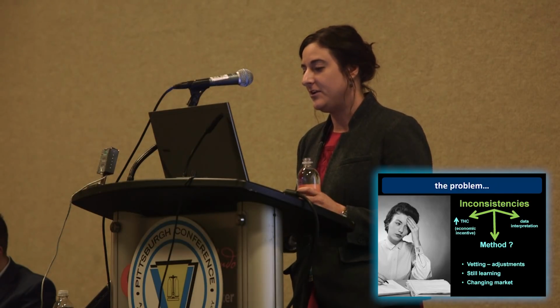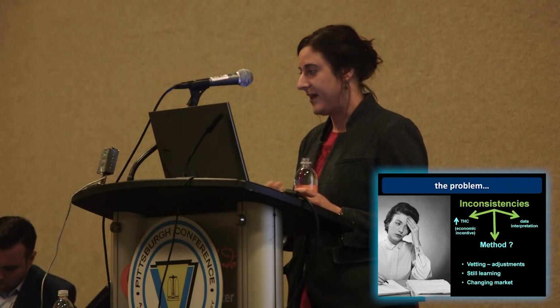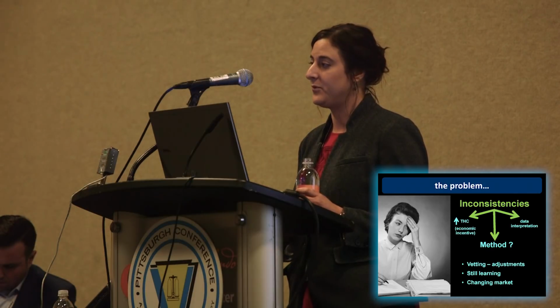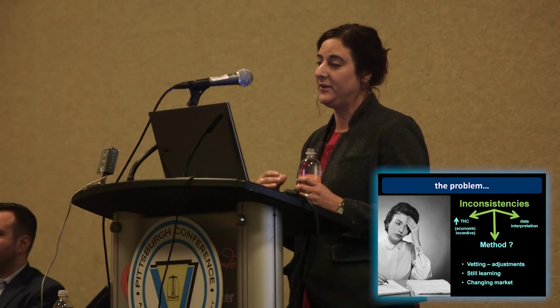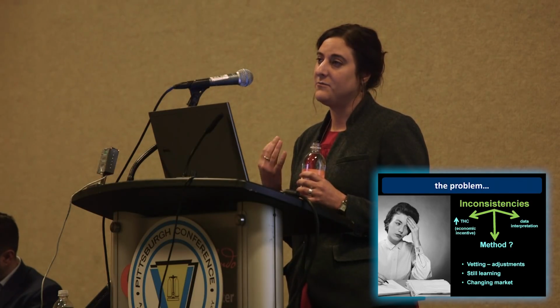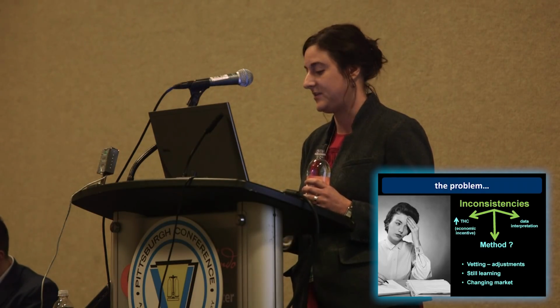I would say, initially it was flower, right? People bring flower, plant material in, they bring concentrates in, then edibles were added, and now what we're seeing is what I call formulated products. This is where people are taking cannabinoids independently, formulating them, taking terpenes, synthetic terpenes, and adding them back in synthetically. So the methods that may have been developed for flower and concentrates may not actually be appropriate for these kinds of new products that we're seeing.